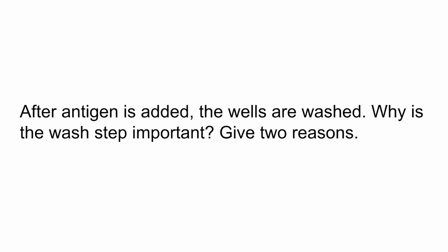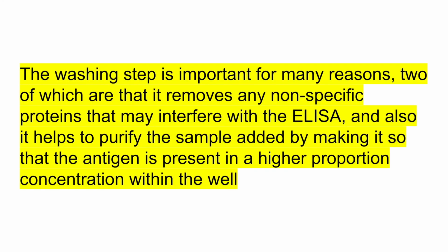So after the antigen is added, the wells are washed. Why is this step important? Give 2 reasons. The washing step is important for many reasons, 2 of which are that it removes any nonspecific proteins that may interfere with the ELISA, and also it helps to purify the sample added by making it so that the antigen is present in a higher proportion concentration within the well.